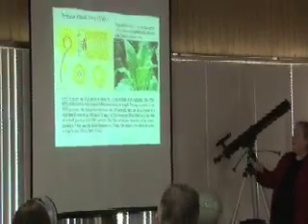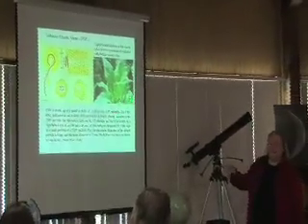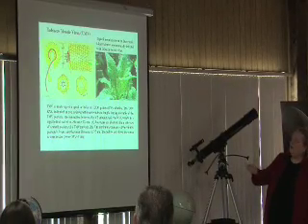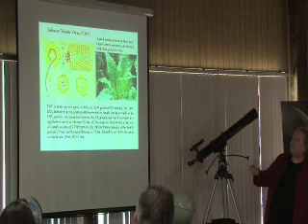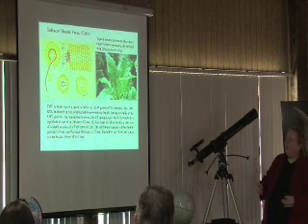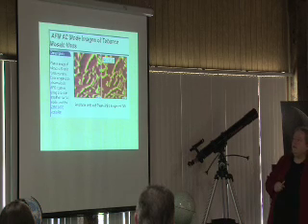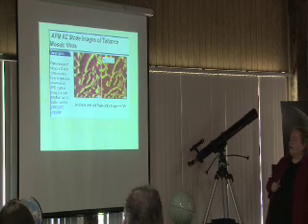And the tobacco mosaic virus, you see the dark patches on the leaves? That's the tobacco mosaic virus. And this is what it looks like schematically. It's like this helix of protein, and it's all wound together in this regular shape, these little rods like this. So this is an AFM image of TMV, tobacco mosaic virus.